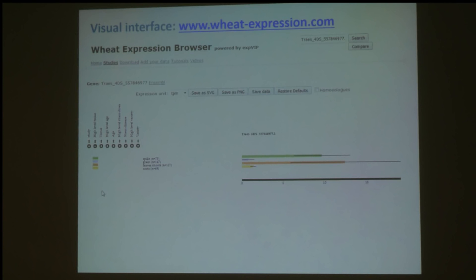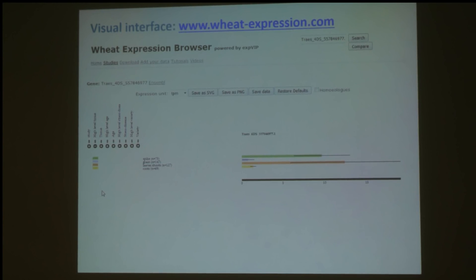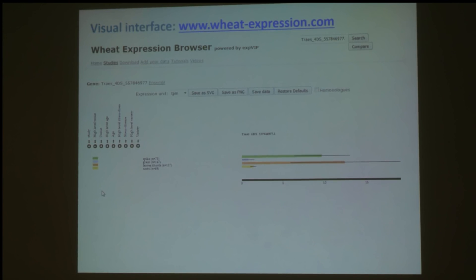This is the interface available at wheatexpression.com. If you look on the left-hand side of the screen, you can see different categories: high-level tissue and tissue, high-level age and age, stress and disease, and variety. These are all different categories of metadata that we've added to each sample. Some samples were from the spike, some were from the leaves, some were from the root, and you can adjust these different categories depending on your needs.